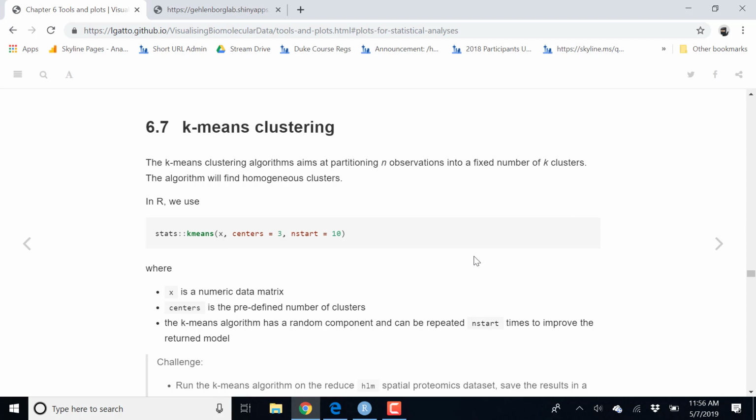So we have k-means clustering, hierarchical clustering, and we can use different distance methods. There is no easy way to answer which clustering methods or parameters we should use. But all these are relatively easy compared to the real difficult question, which is how many clusters to find. There are more sophisticated methods that, as part of the clustering, try to estimate the number of clusters they need to find. But these are very often ad hoc, developed for specific types of data sets. And the best thing is to start with simple methods like k-means.